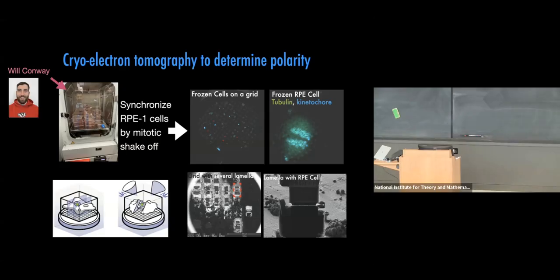And then the thing is, because a cell is too thick for the electron beam to penetrate through, you have to cut everything away but a 200 nanometer thin lamella. So this is the cartoon for it. And this is how it looks, right? You can see the grid looks also very beaten up, I think, but there's all sorts of lamellas here. And this is how the lamella looks from the side, right? So we can agree that the cell probably was kind of all around here. And now we are left with this really thin stripe. And so you can also guess that if you have a small structure you're interested in, targeting is a huge problem, right? Finding what you want to look for is not easy.